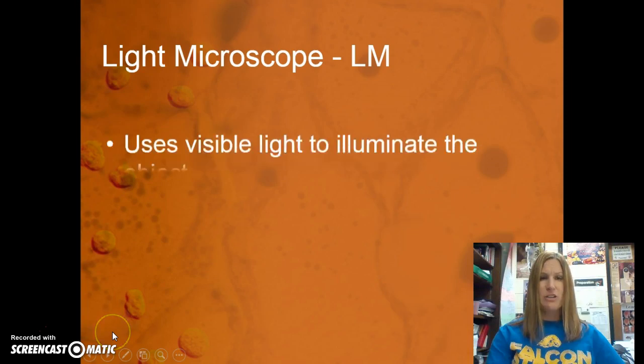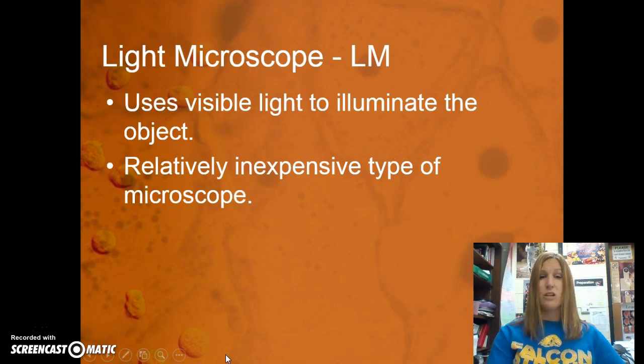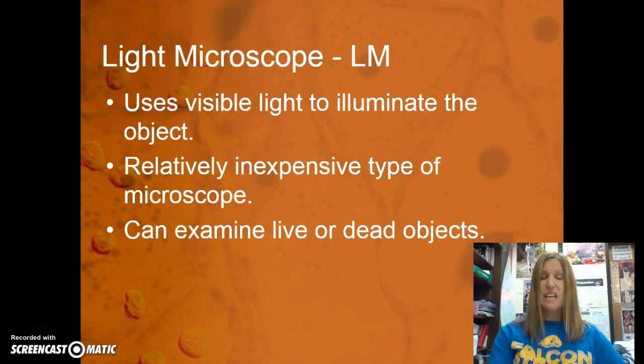So let's talk about light microscopes, or LM for short. These use visible light to illuminate the object, and they are a relatively inexpensive type of microscope. And they can examine live or dead objects, which is a huge benefit.